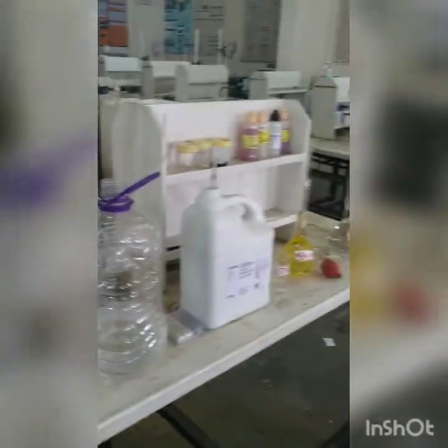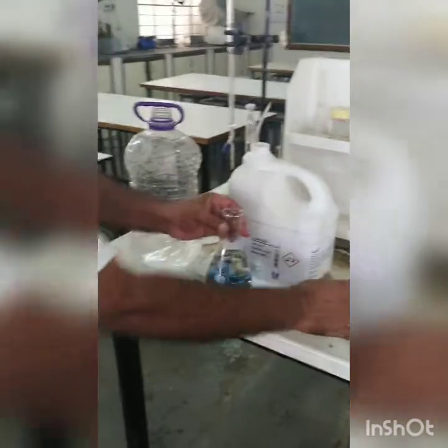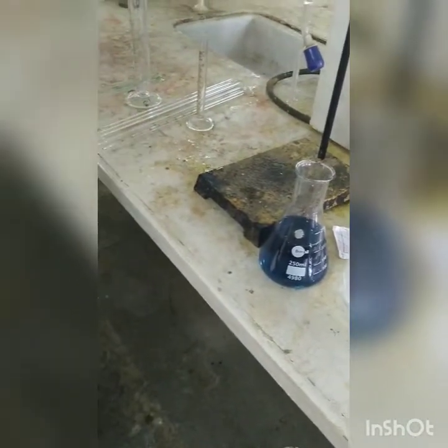Now we have to add starch indicator, 1 or 2 ml of starch indicator. You can see the blue color has developed. Okay. Now we have to titrate it against sodium thiosulfate.